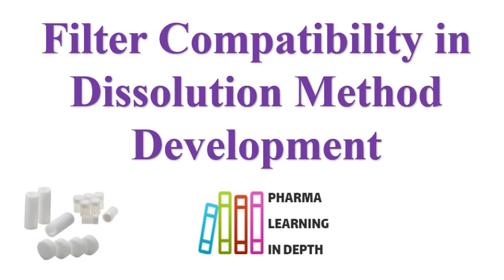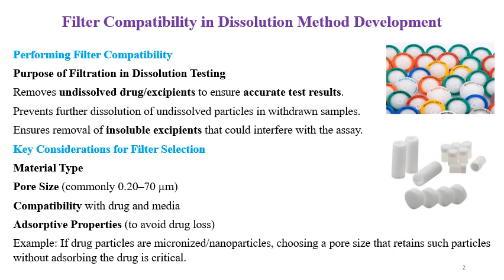Welcome, dear viewers, to this important topic on filter compatibility, filter selection in the dissolution method development. So, performing the filter compatibility is a critical activity. What is the purpose of filtration in the dissolution testing? We need to understand. Filtration removes the undissolved drug or undissolved excipients to ensure accurate test results, because if these undissolved particles are there, they will interfere with the results.